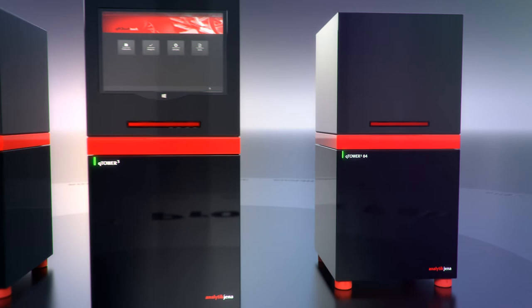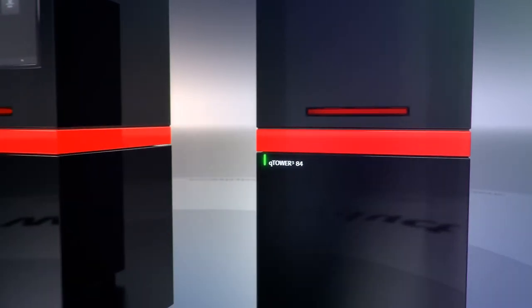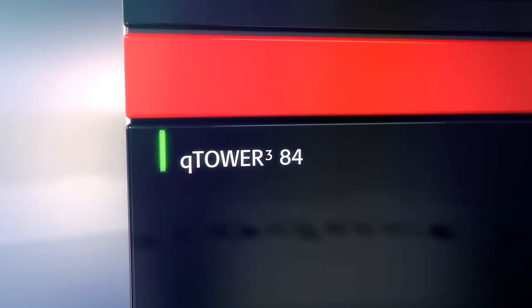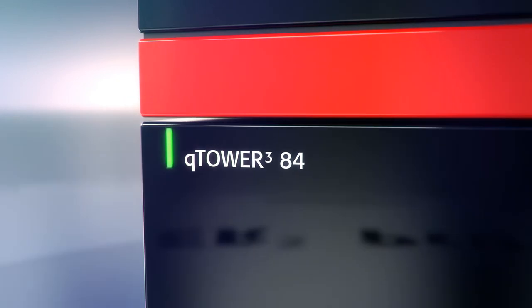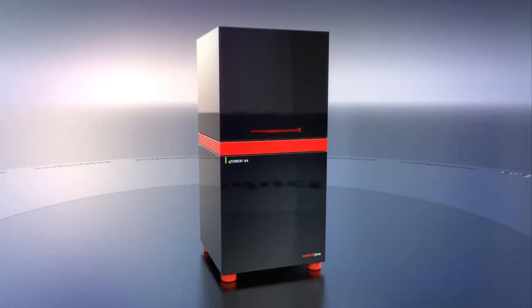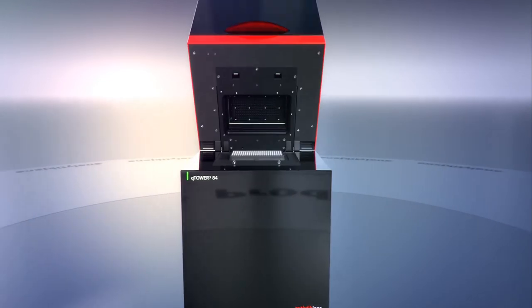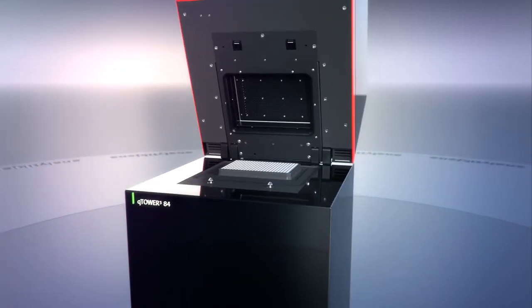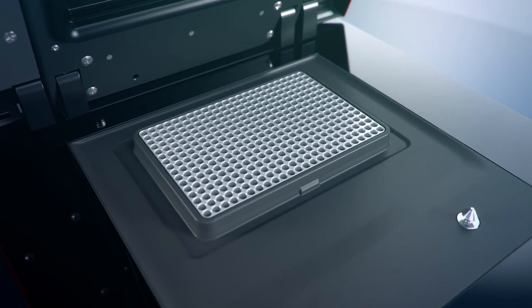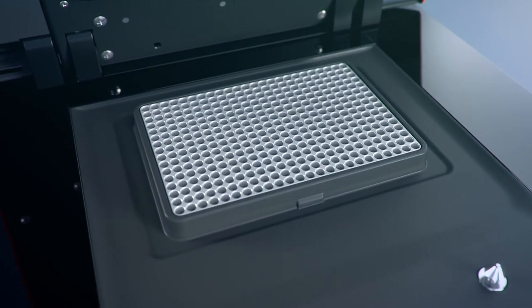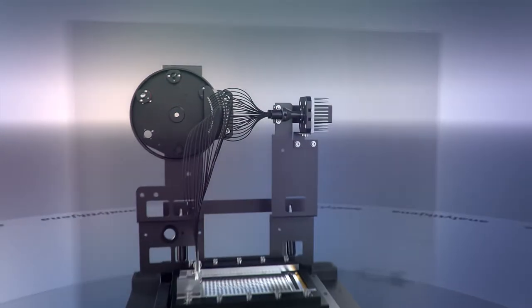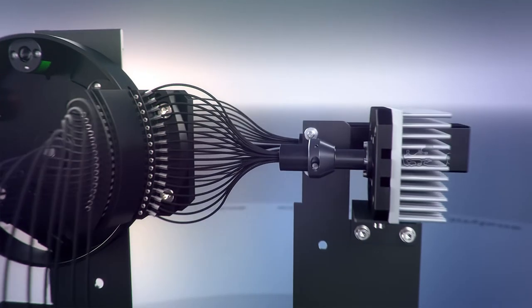A high-quality aluminum sample block guarantees precise, accurate temperature uniformity across the entire sample set. The fiber optic shuttle system has been perfectly adapted to the 384-well format and expanded to 16 fibers.